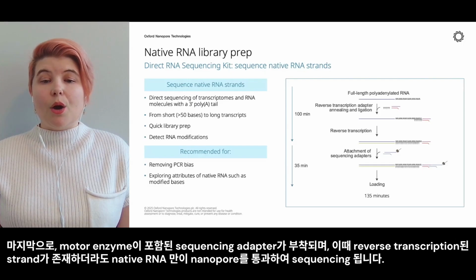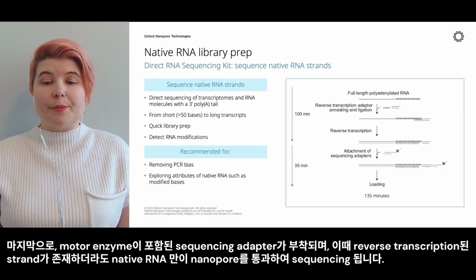In sequencing, only the native RNA strand translocates through the nanopores and is sequenced, even in the presence of the reverse transcribed strand.